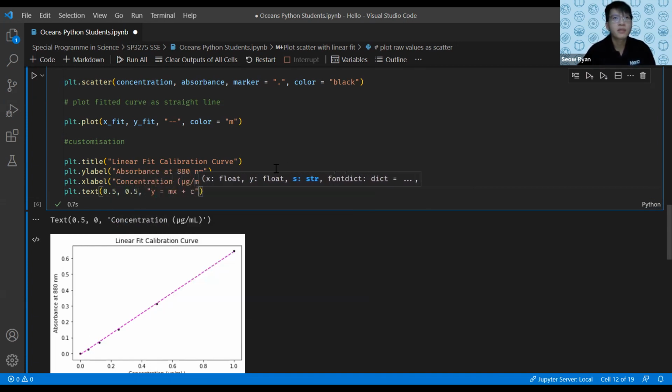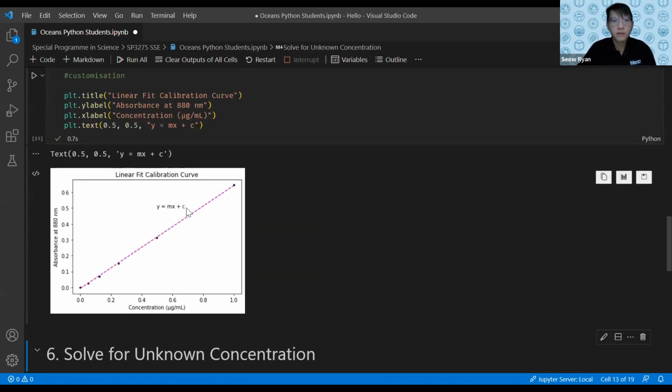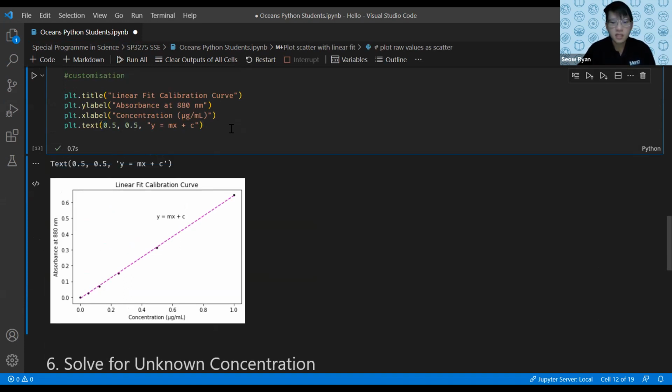I'm not going to put it, but I'm just going to take an example like this, right? So it's going to be there, which if you're okay with it, then we just leave it. If not, just change the values to wherever you want to put it. Okay, so it's going to look something like that. If you wanted to add another line, just add another line, you know, you want to put 0.5. Okay, so now it's going to be at the same place, but lower, so 0.4.